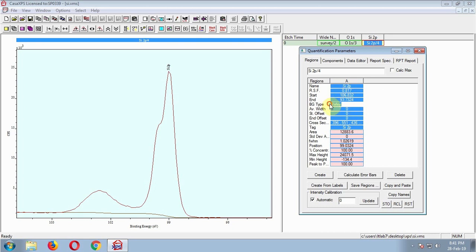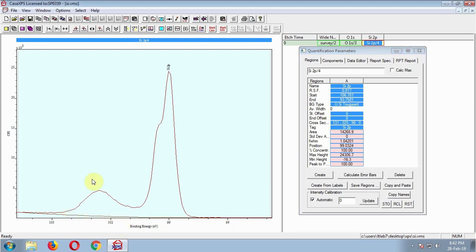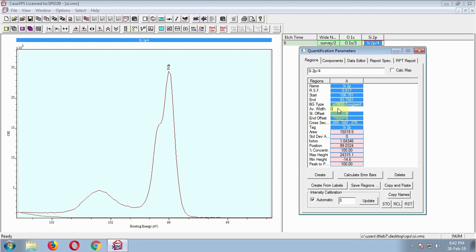Here comes the first important step: the background type. By default, the function is Shirley. I want to see how other functions will fit. I am changing Shirley to Silicon Tougaard. To do that, I have to enter U Si. It seems not bad. Let's check other functions similarly — entering U SiO2 to use U SiO2 Tougaard.